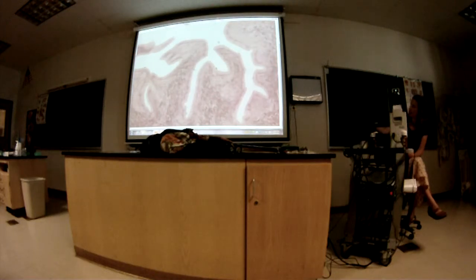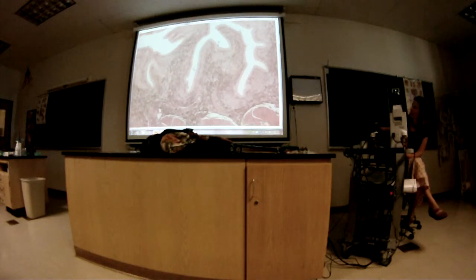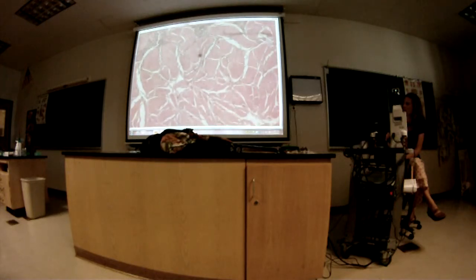What kind of epithelium do we have here? Transitional, same as the ureter, right? It's still a mucous membrane, so we still have the underlying lamina propria, which is right under here. Submucosa is here too. Lamina propria is right under the epithelium, and submucosa is a little deeper. The urinary bladder actually has the submucosa and the ureter doesn't, which is kind of weird. But the more important layer is this one.